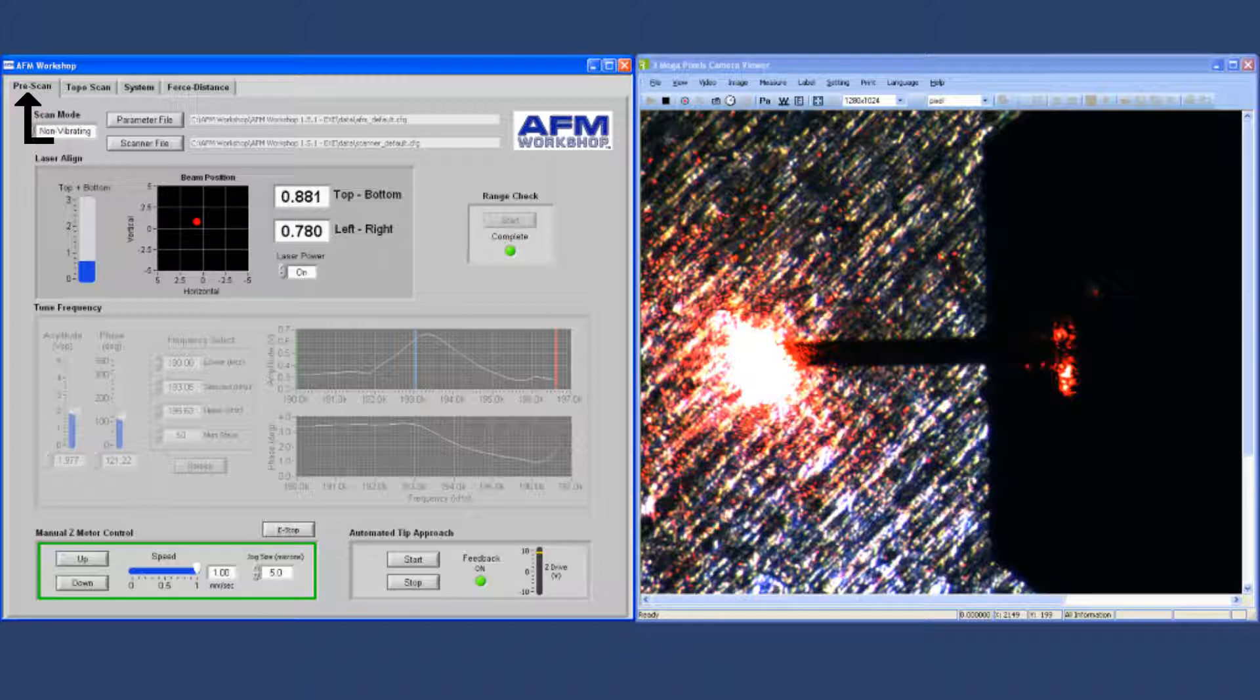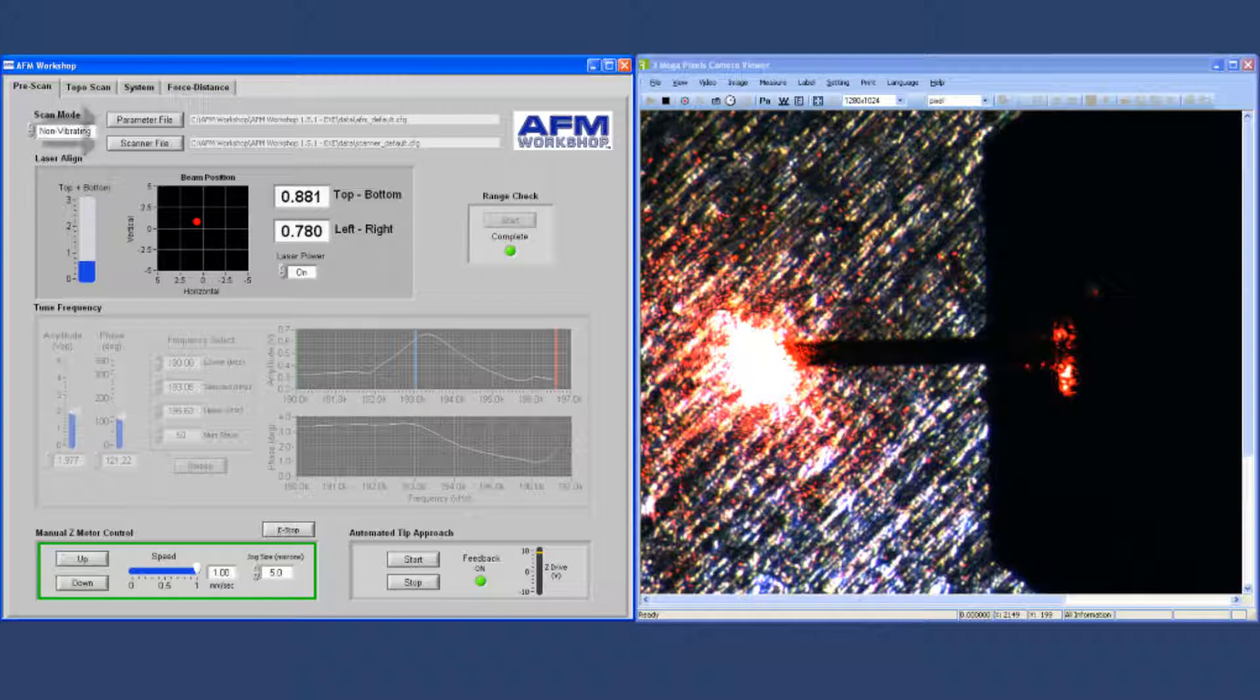At the top of the screen is the selection of the scan mode, either vibrating or non-vibrating. Additionally, there are parameter input files, which are used for selecting system files for the particular type of scanning that you'll be doing.